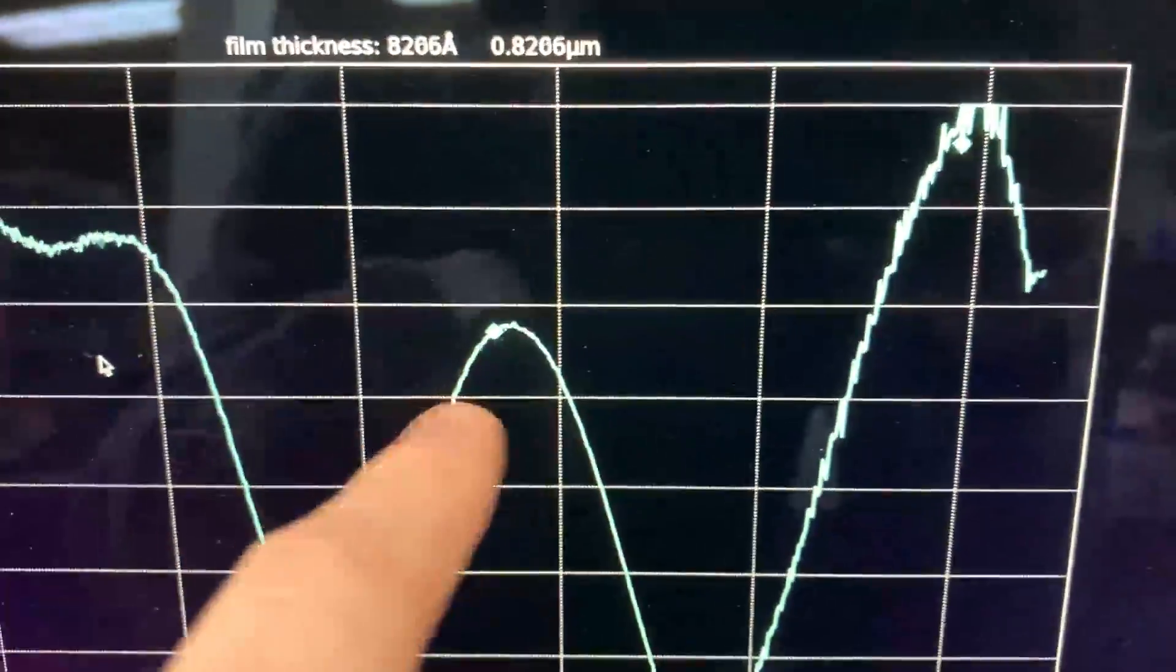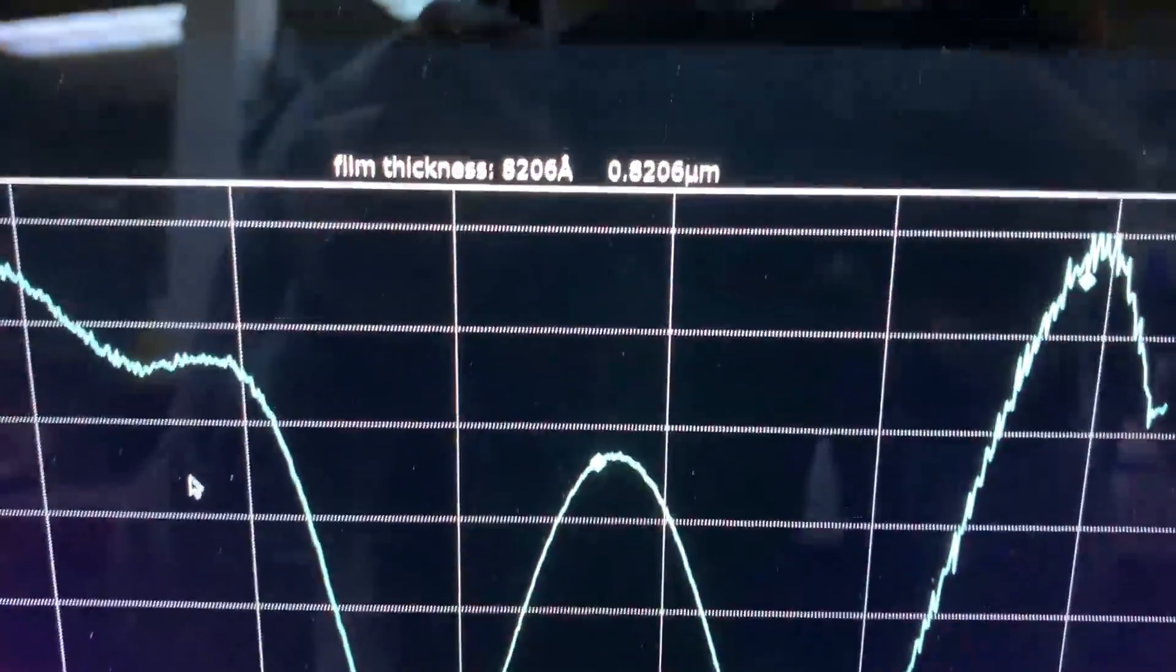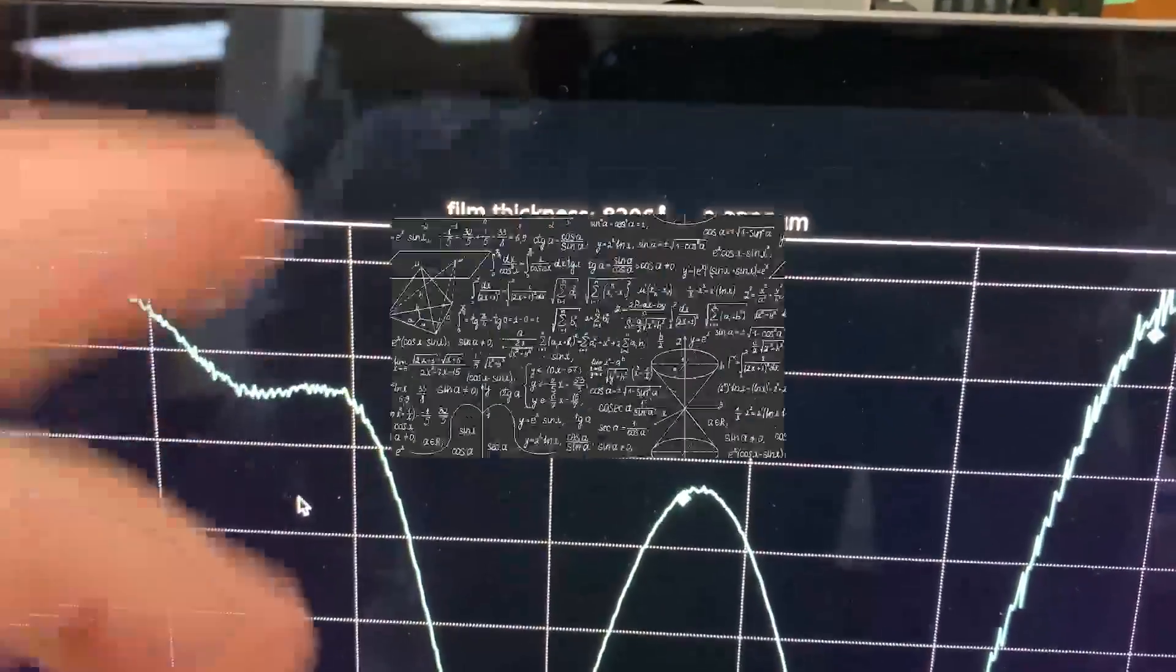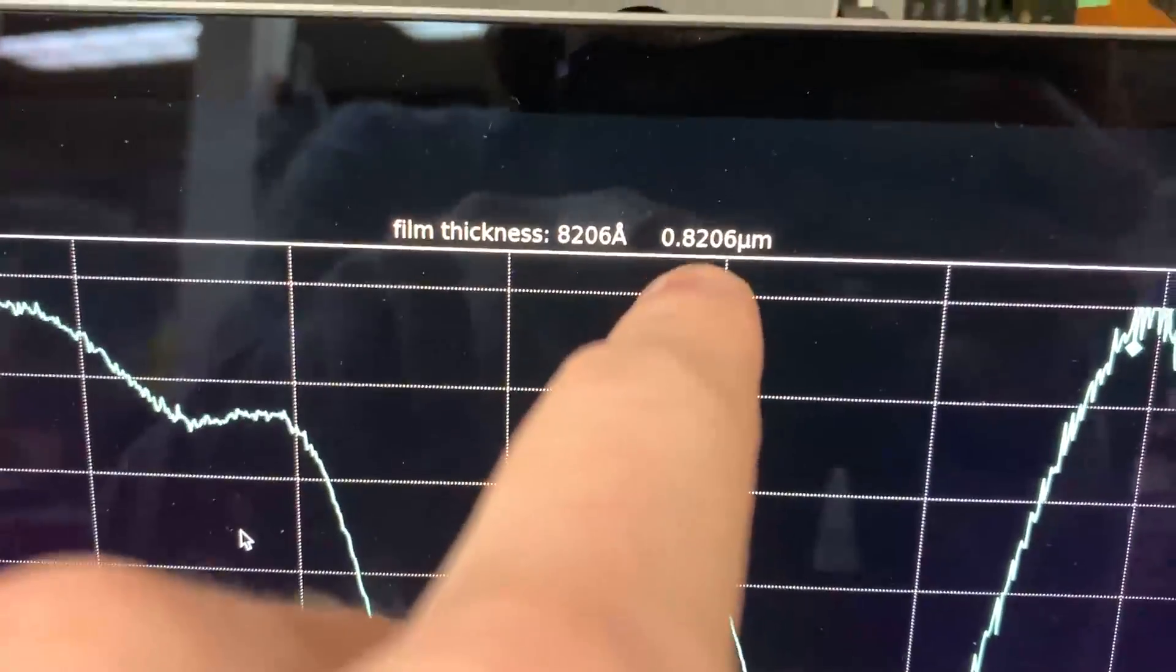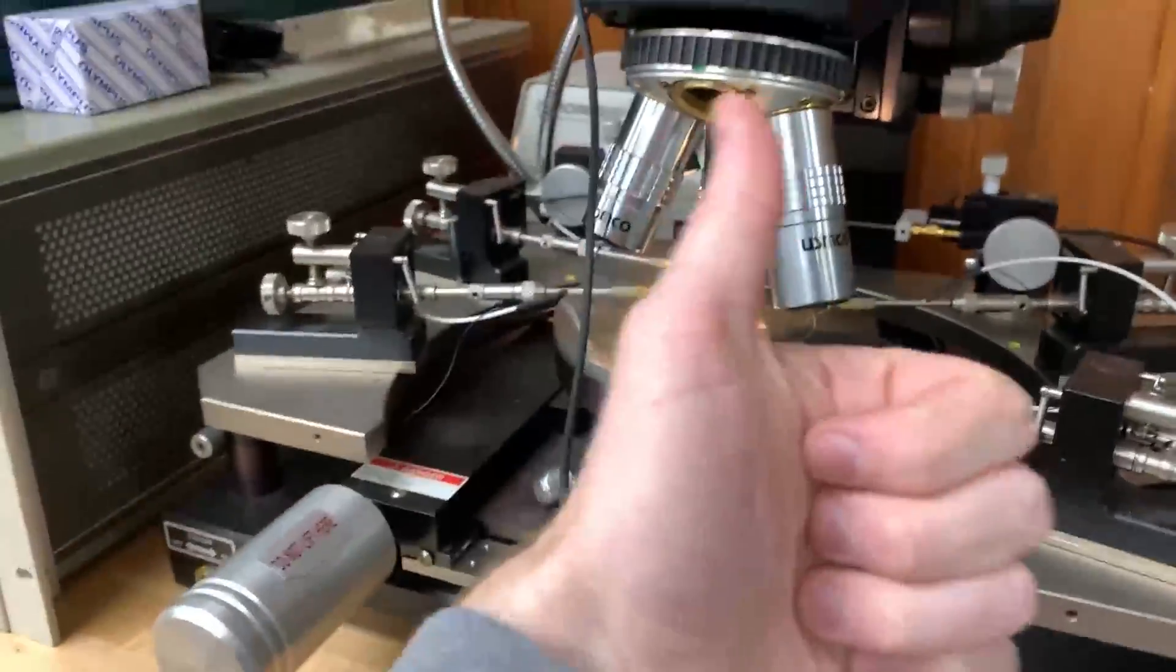It's found those peaks with little markers at the maximum minimum points and then given that spectra it's done some math which I'll show you and it said that our film is about 820 nanometers in thickness which is in pretty good agreement with the 750 nanometers we expect so this is great.